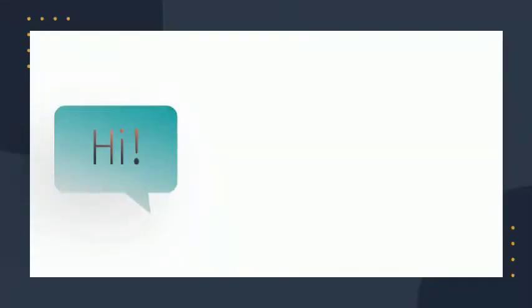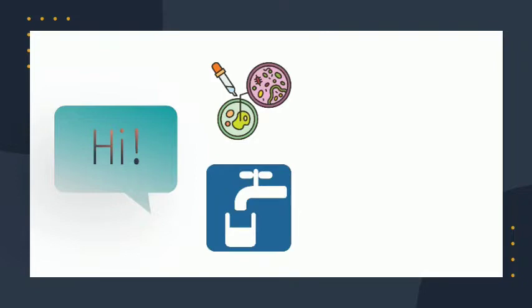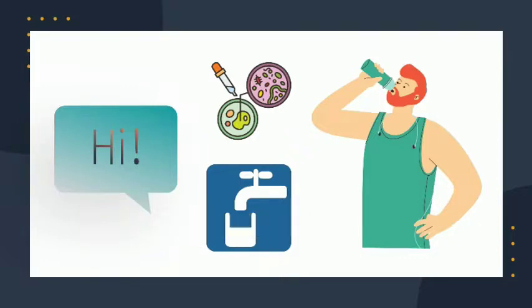Hi everyone. Today let us discuss the most favorite microbiological tests used to test water potability, the property of whether it's fit for drinking or not. This method has three parts: presumptive test, confirmed test and completed tests.